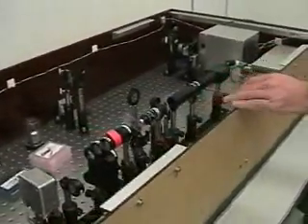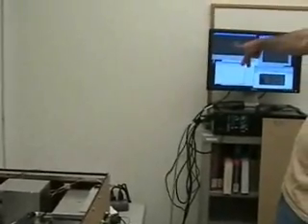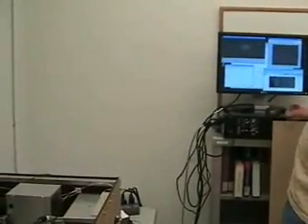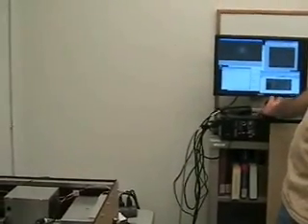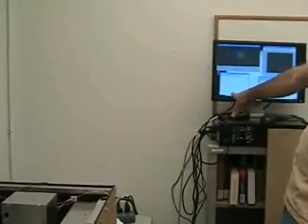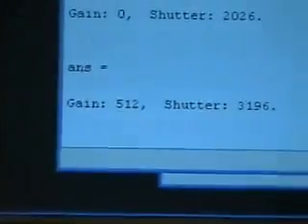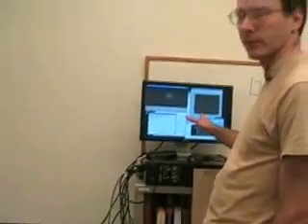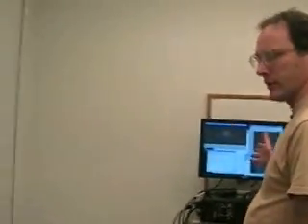So there's now light coming through the sample. And if you look here, you actually see I've already focused it, so there's a little bit of bright spot here. And in order to see that at all, I had to turn my gain and my shutter to maximum. Now, your samples will probably be brighter. This is an old sample. It's not very bright anymore. So I had to go all the way to maximum. But you may find that you saturate if you're close to maximum, and that you actually have to back off some.